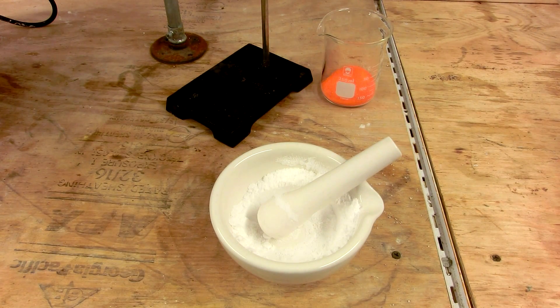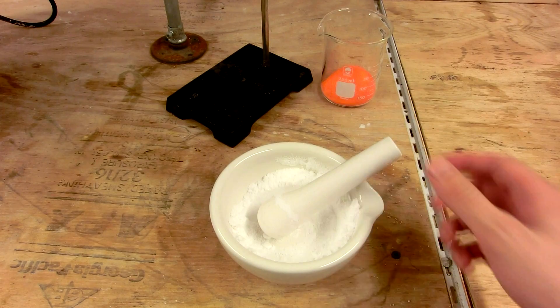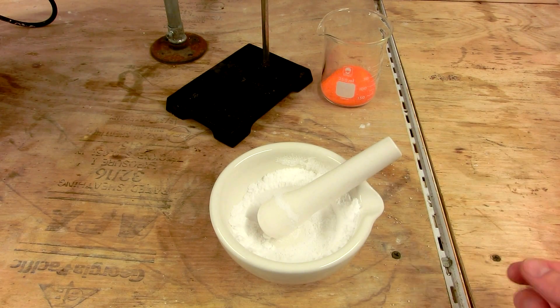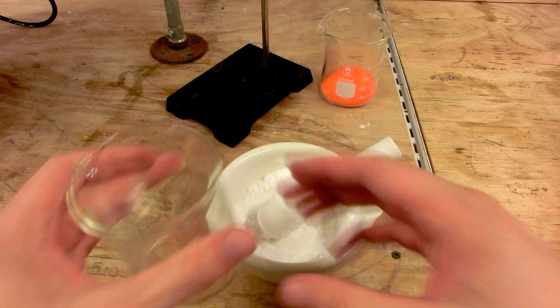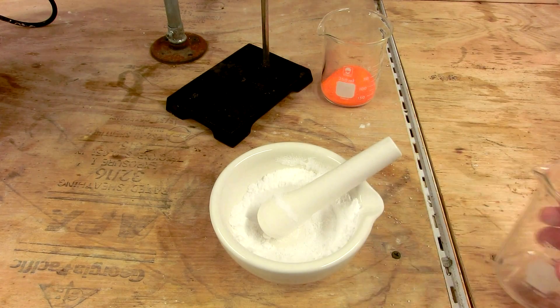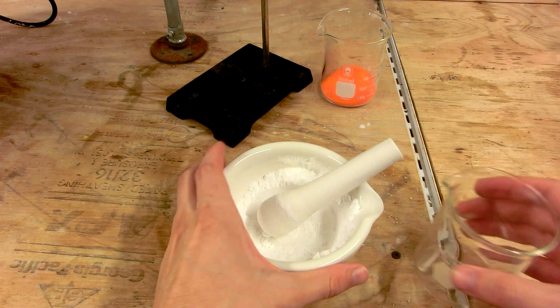Once you get the salt crushed as finely as you can get it, and I prefer to buy flake salt because it crushes much easier than granular salt, you can transfer it into a separate container so you can then crush the potassium dichromate.